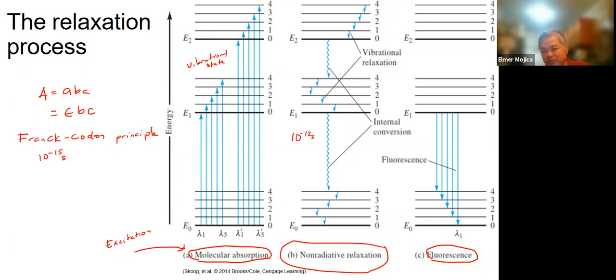So when a band of wavelengths is irradiated, when you put light or introduce energy, the excited electronic state is what we call populated. You only have an excited state when energy is applied.